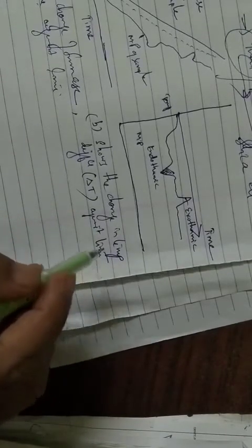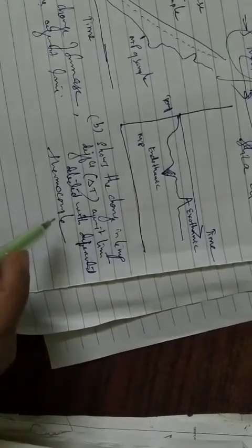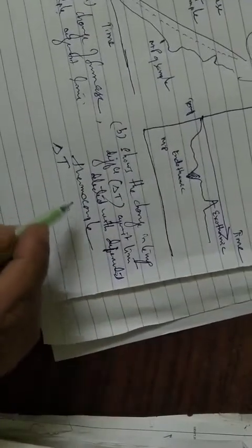Okay, so this is what is detected with the differential thermocouple. So here the delta T, whatever we are going to get, is referred to as the DTA signal.